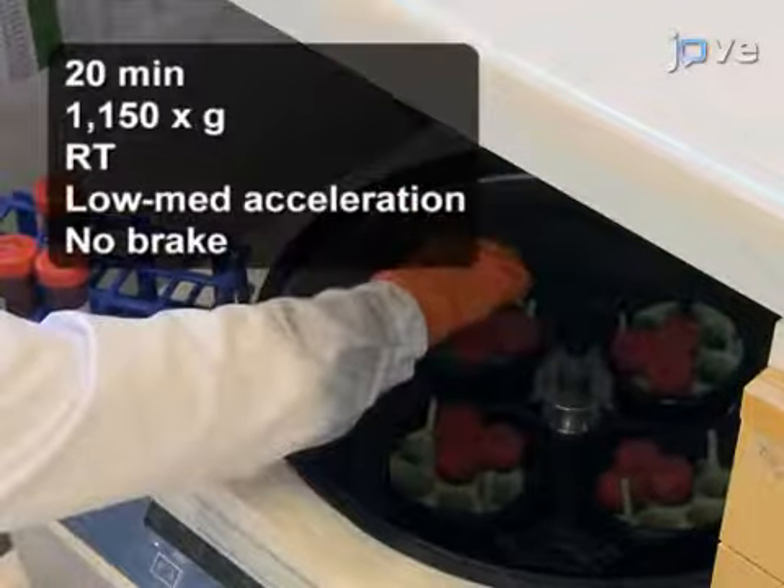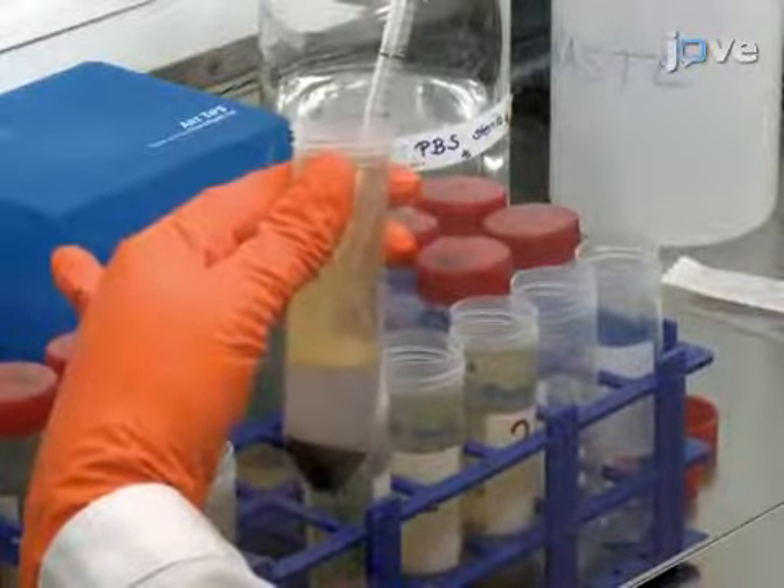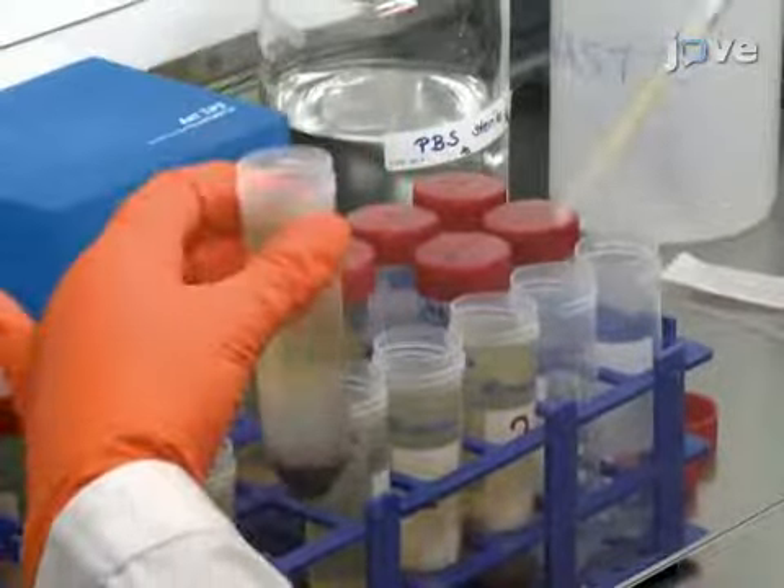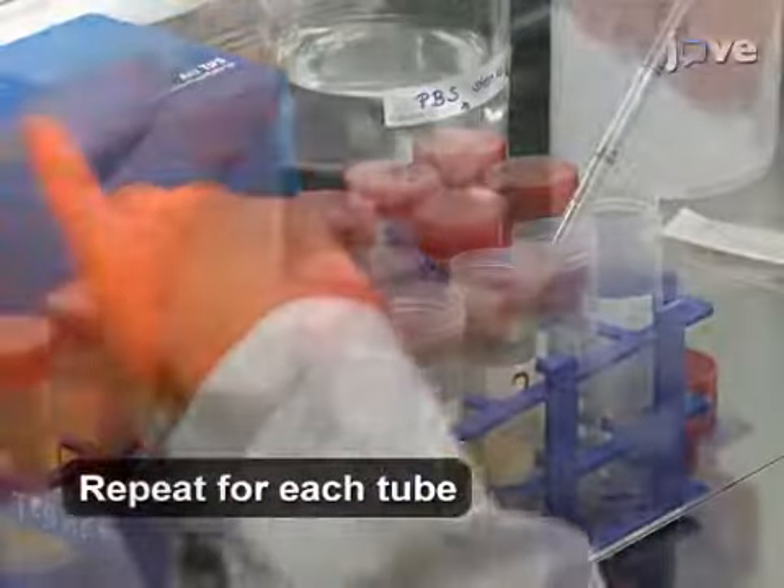Separate the cells by centrifugation. Then, transfer the white PBMC layers between the density gradient and the plasma phases from each tube into new 50 milliliter conical tubes.